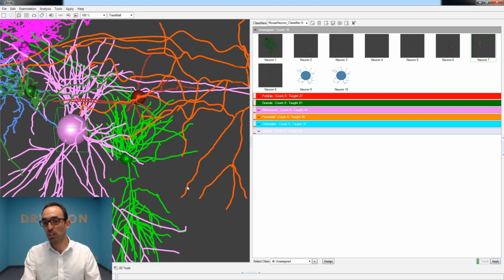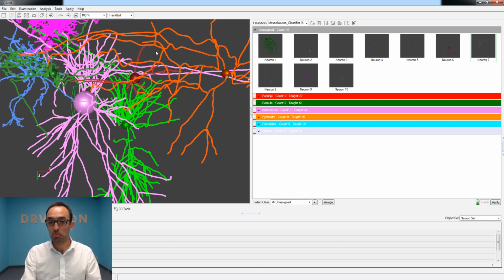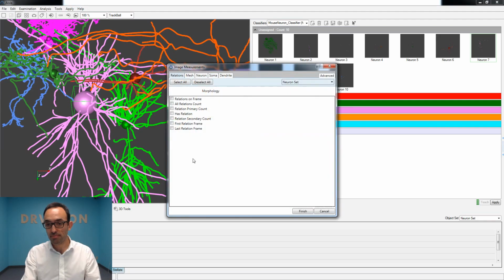And what you will see, and I'll open it so you see it. So right now there are no objects down here, no tabs. That means there are no subgroups created yet. But once I hit this button, the classifier that we have pre-taught will be applied on these images, on these neurons, and as a result there will be multiple tabs down here. This is in the spreadsheet zone. So if I apply it, you can now see all of these are visible.